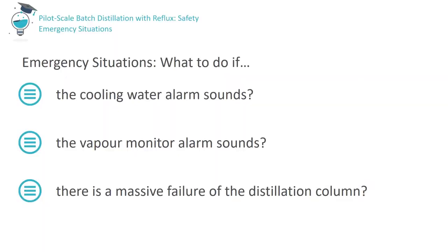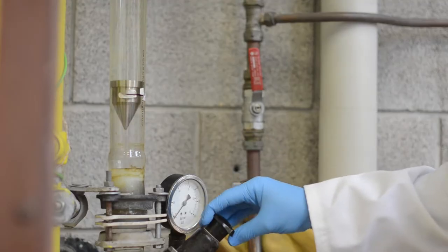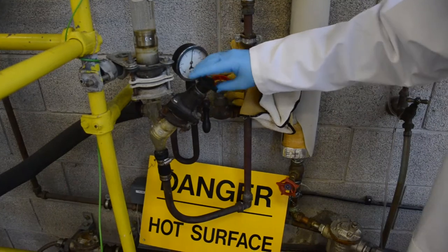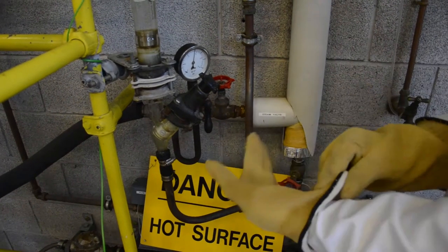Now let's consider what action must be taken in case an alarm sounds or another emergency arises — specifically if the cooling water alarm sounds, if the vapour monitor alarm sounds, or if there is a massive failure of the distillation column. If, while operating the column, you hear the water alarm sounding, check the water flow meter. If the flow rate has fallen below the set point, attempt to manually increase the flow rate until the alarm ceases. However, if there is a complete loss of cooling water, immediately shut off the steam supply to the column by closing the steam valve on the supply line while wearing an insulated glove.